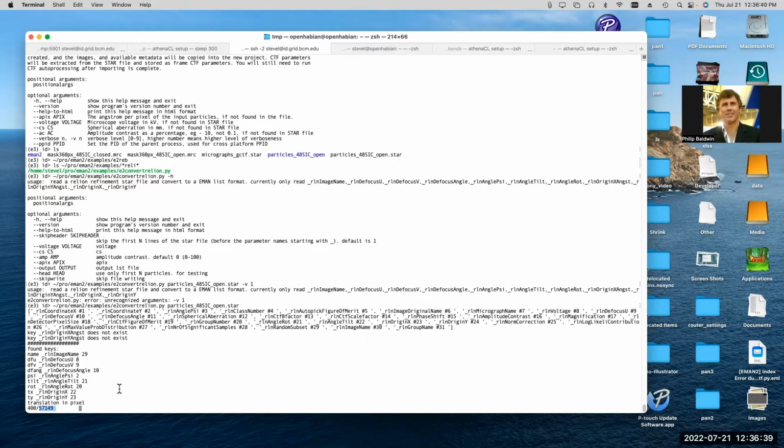Then why does it take so long? I was a little surprised. Why does what take so long? You said it would take 20 minutes. No, that's because it's also copying all of the data from MRC format to HDF format and compressing it. Oh, I see. If we tell it to skip the data copy, then you're right, it'll probably only take 10. Okay, just trying to keep on top of all the points. No, I'm happy to take questions when you have them. I'm spewing out lots of random knowledge from 20 years.